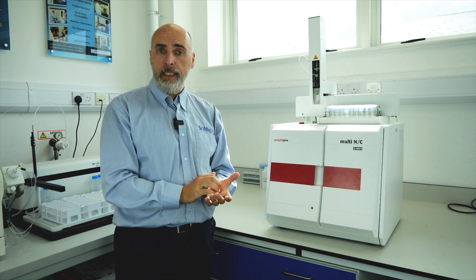Hi everyone, my name is Matt from SciMed. I'm going to give you a quick overview of one of the two TOC TN analysers that we offer from Analytik Jena.